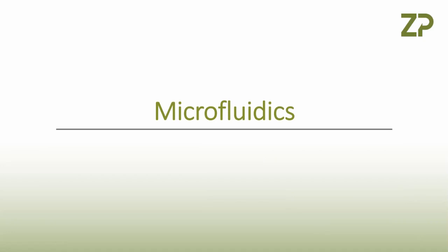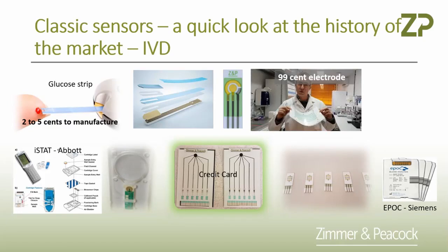Microfluidics is really important for biosensors. There's another term out there called in vitro diagnostics, IVD. People talk about this all the time, in vitro diagnostics. In vitro diagnostics for me, obviously, is the detection of samples that are relevant to human health. And within that sample is an analyte linked to some sort of health status. But what I want to say is in vitro diagnostics is really the marriage between biosensors and microfluidics. So microfluidics is really important to biosensing.